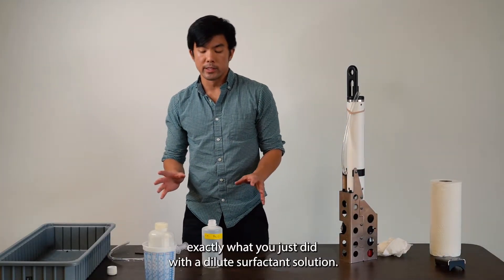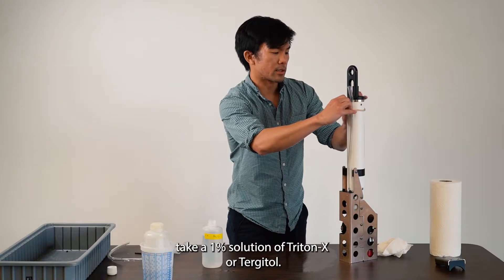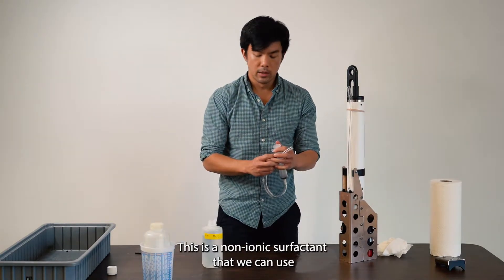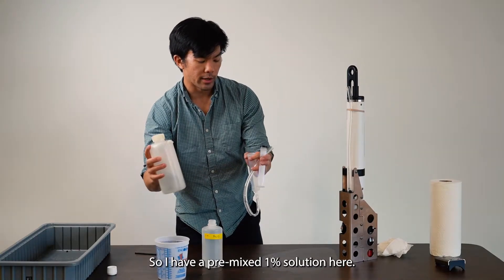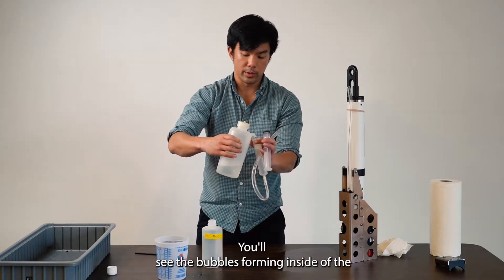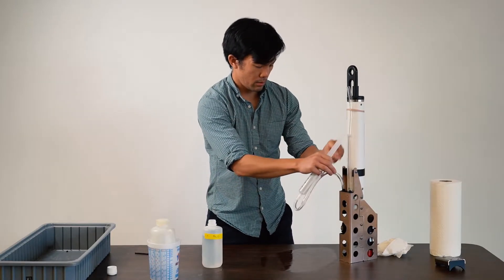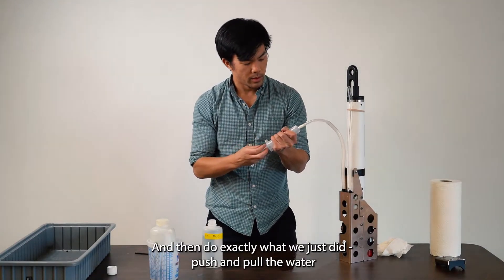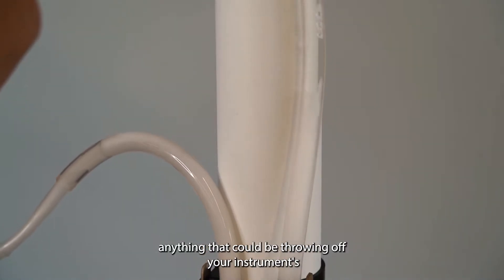The next step is to repeat exactly what we just did with a dilute surfactant solution. What we typically use is a 1% solution of Triton X or Tergitol — a non-ionic surfactant that we can use to clean the conductivity cell and the oxygen sensor. I have a pre-mixed 1% solution here. Fill up the syringe from this end — you'll see bubbles forming inside the syringe. Fit the tubing onto the instrument and push and pull the water through the flow path to remove any biofouling, any oil, or anything that could be throwing off your instrument's membranes.